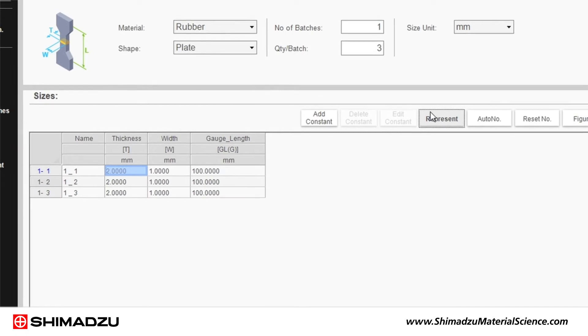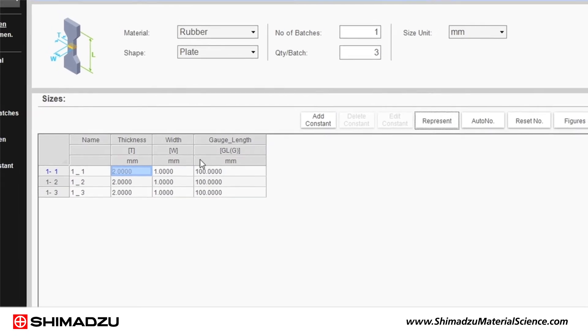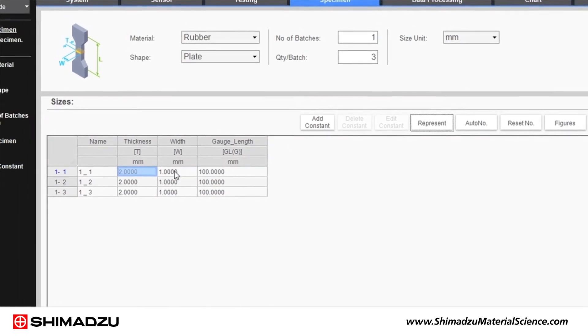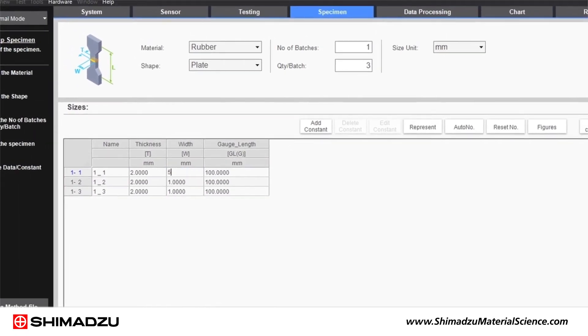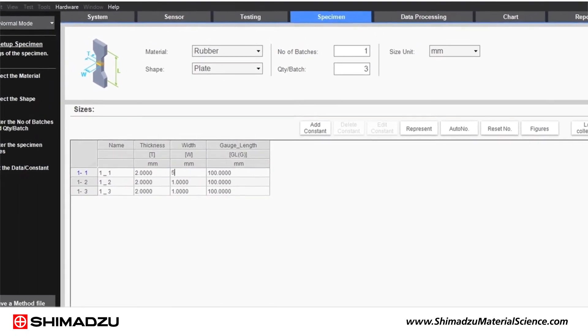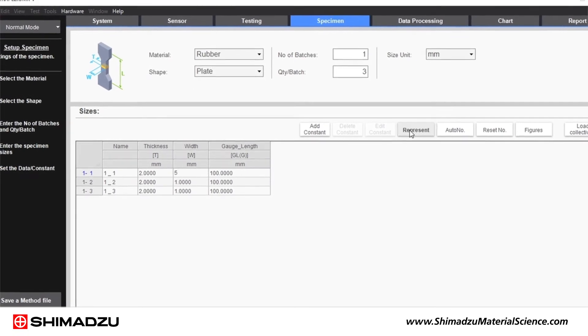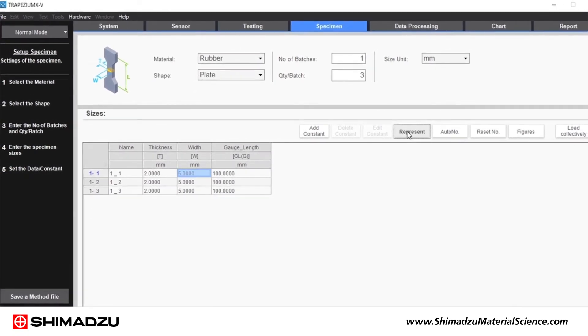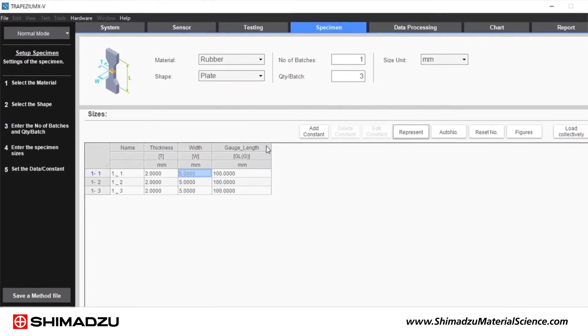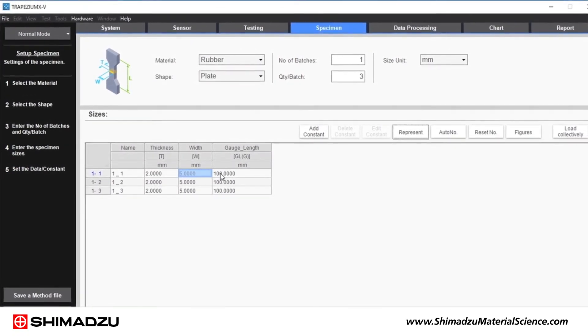The specimen window can be used to specify the number of test samples, material, shape and dimensions, allowing you to perform stress and other calculations dependent on sample geometry.